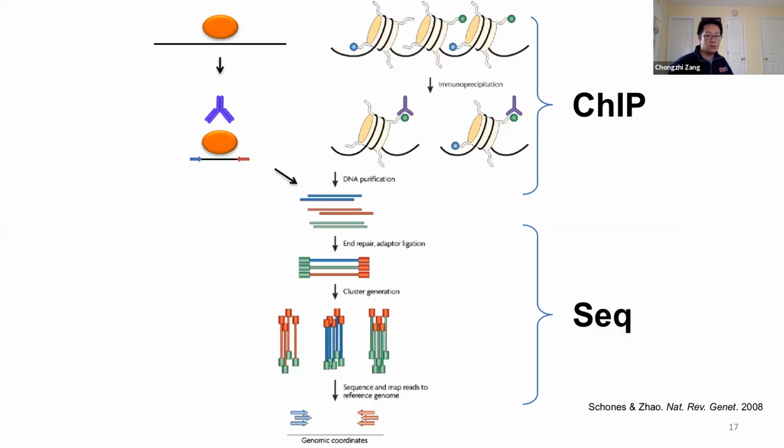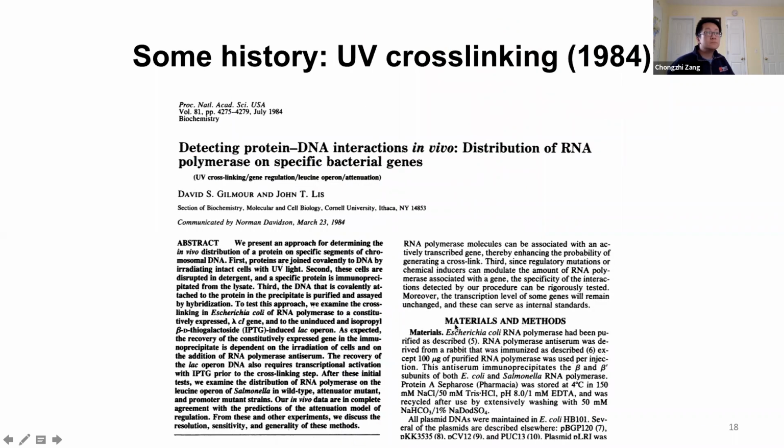So that's the whole procedure of ChIP-seq. I'm always interested in some history about the development of these technologies, so I'll just give an overview of the history of how this experimental technology was developed.